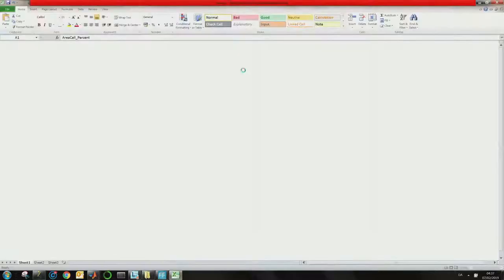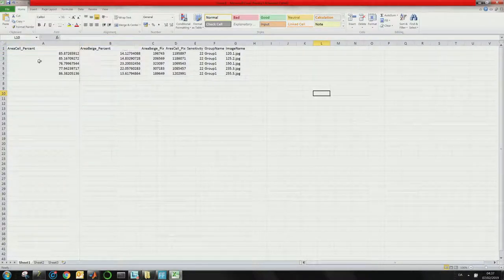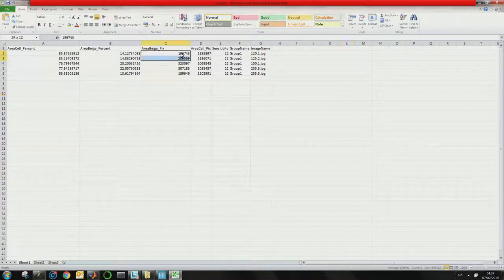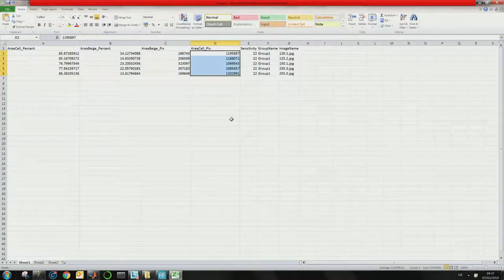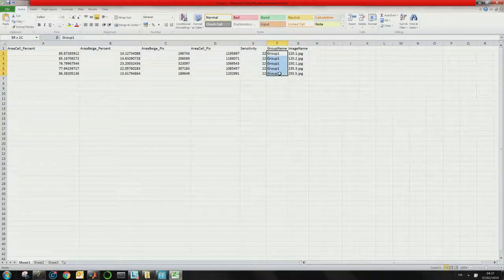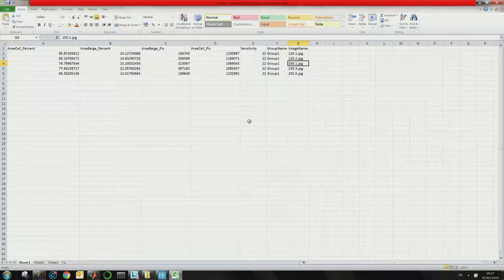Looking at the output format, the column names are: area cell percentage — meaning white adipose cell area percentage — beige area percentage, and similar values computed in pixel numbers, in case the magnification or resolution changes. It will also tell you the sensitivity used, the group name for the analysis, and the individual file name, which is useful for tracking outliers.